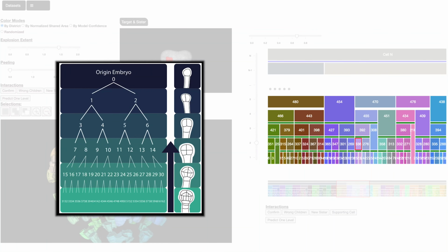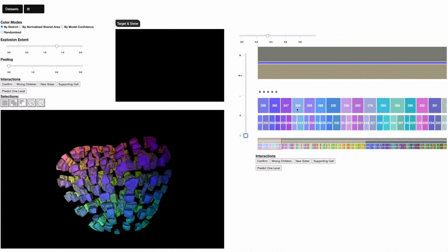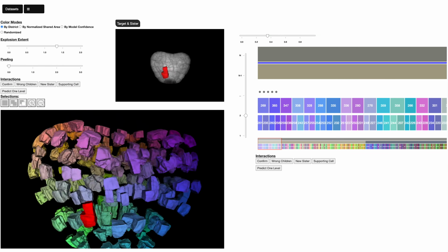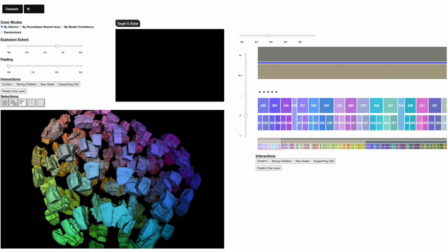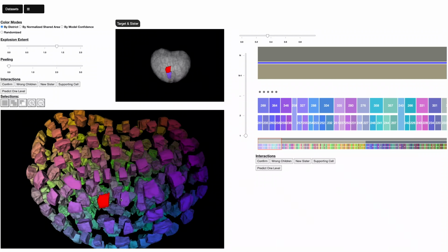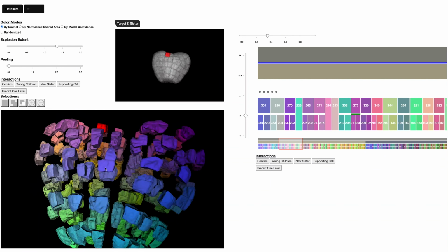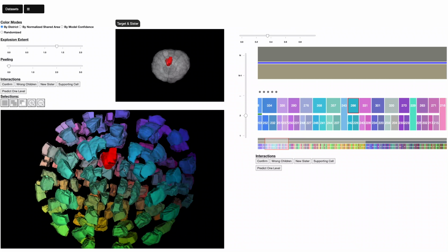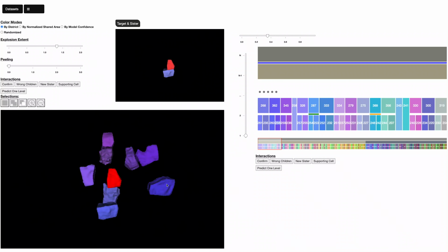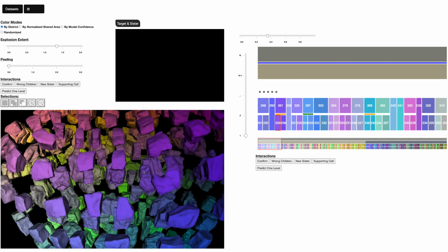Traditionally, biologists manually established the lineage bottom-up. To ease this process, we use a linear classifier to predict likely cell pairs based on past lineage data, one level at a time. Biologists then verify or correct these assignments. Biologists can target a given cell, analyze its neighborhood, and correct the assignment in the 3D environment.